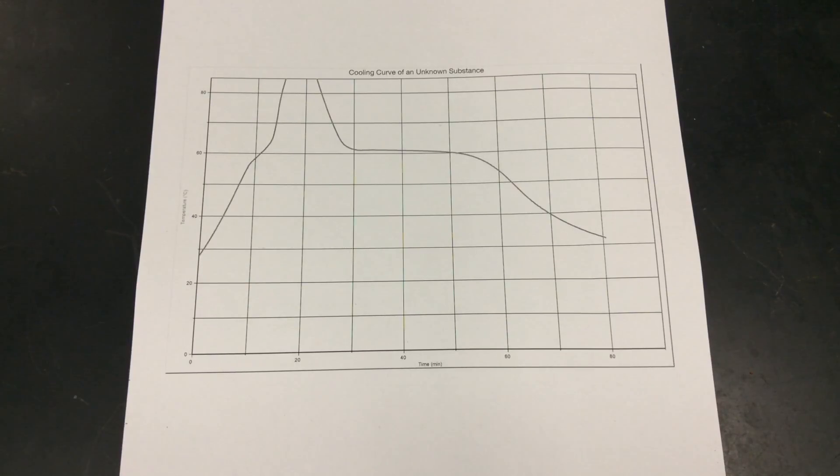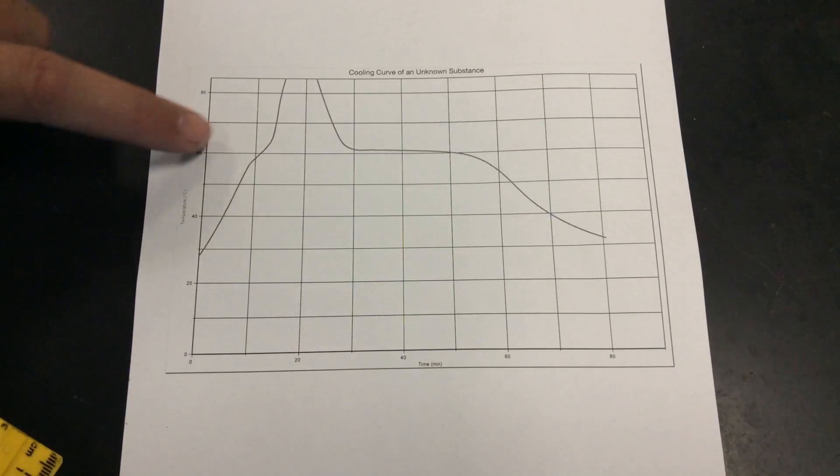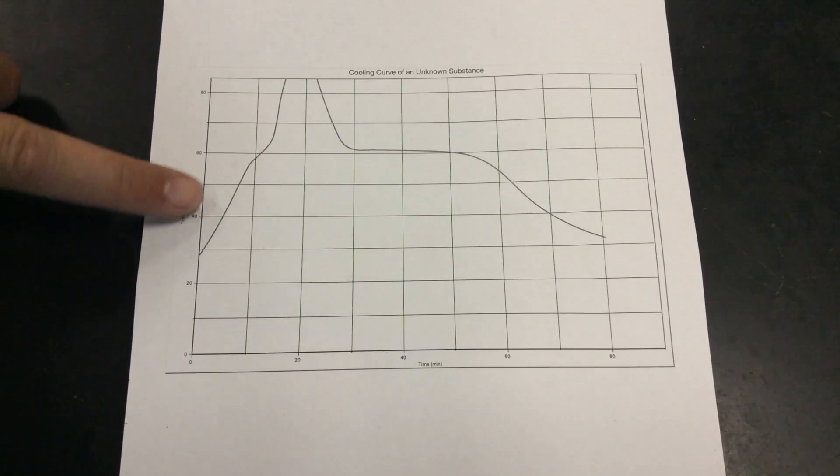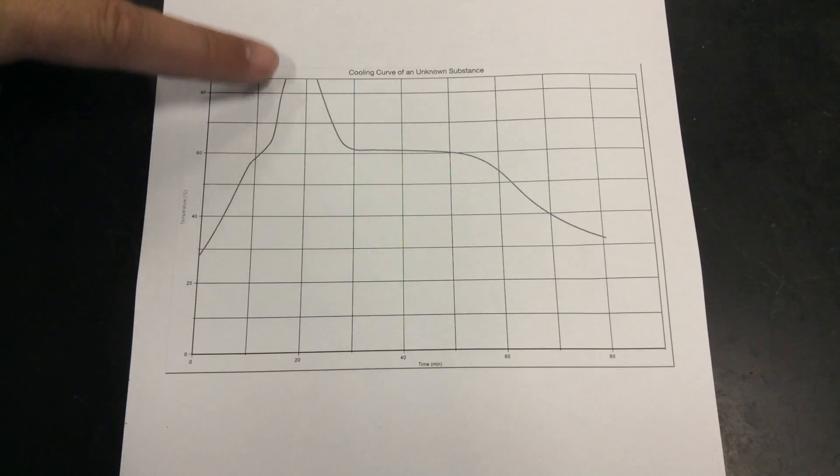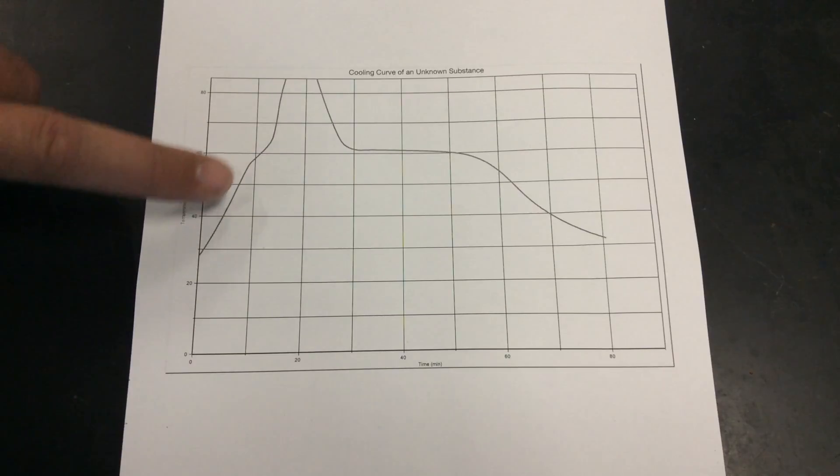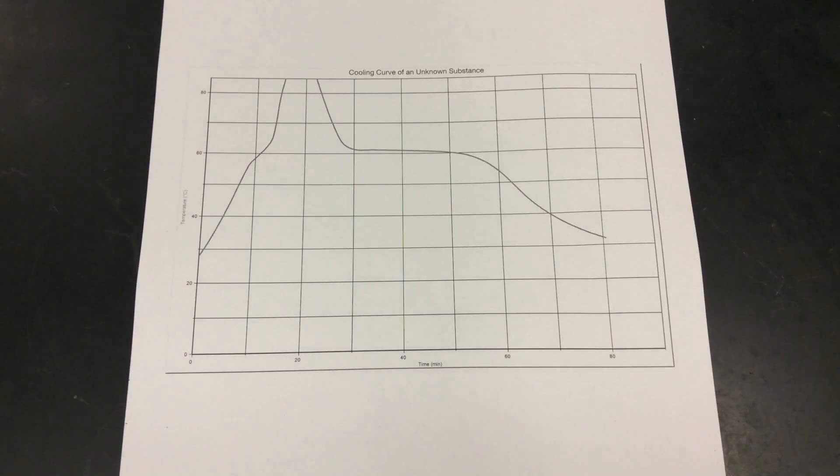We have now a hard copy that I need you to print out that you would have doing the lab. We should have recognized something that the portion of the graph that goes up here represents the heating curve. As I mentioned in the beginning, the heating curve isn't the best way to observe where the phase change temperature resides and find that nice flat line point or that place where the kinetic energy stays the most constant during the phase change.